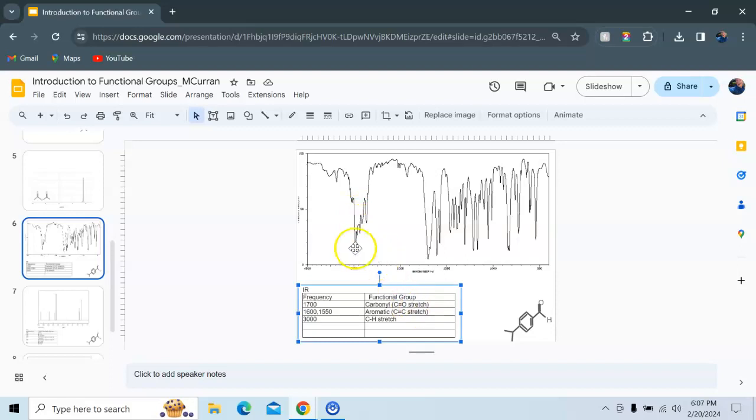And I have multiple peaks, so these ones here are from the benzene ring, which would be each of these individual hydrogen atoms coming off of it, and then the main peak down here would be from the isopropyl group down here. Cool. So from the IR spectra, I know that there's a carbonyl, an aromatic, and then the CH stretches. So as we guessed with the degrees of unsaturation, an aromatic and a carbonyl will account for those 5.